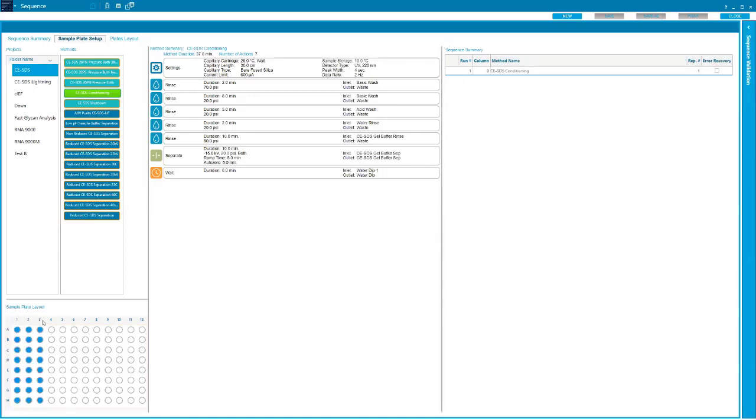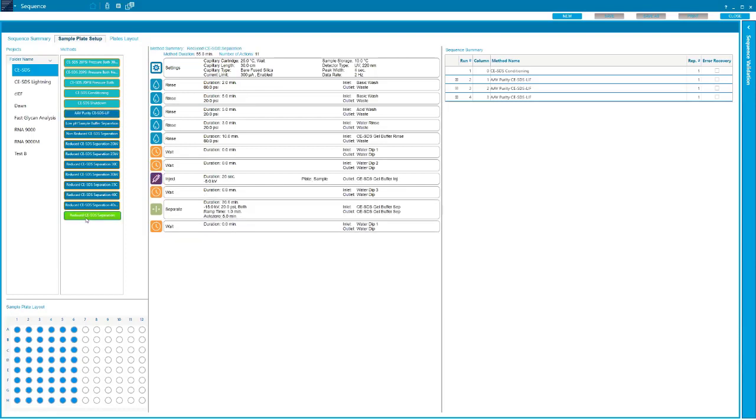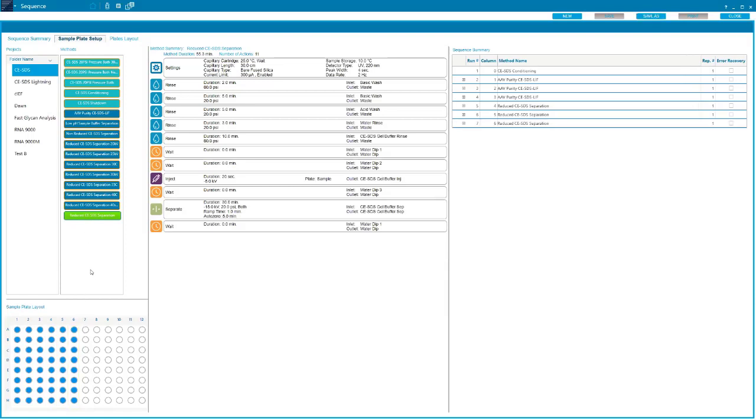Now, let's say we have six columns of samples. We can take our AAV purity with CE-SDS LIF detection, and maybe we're going to run that in our first 3. So in our first column, for example, we can generate a standard curve to do that titer estimation I've been alluding to. In our second and third columns, maybe that's our unknown samples. And then for our fourth, fifth, and sixth column, maybe we just want to do a standard UV analysis. We have some other therapeutic we're trying to analyze, or we have a higher concentration AAV product, or we just want to do a comparison.